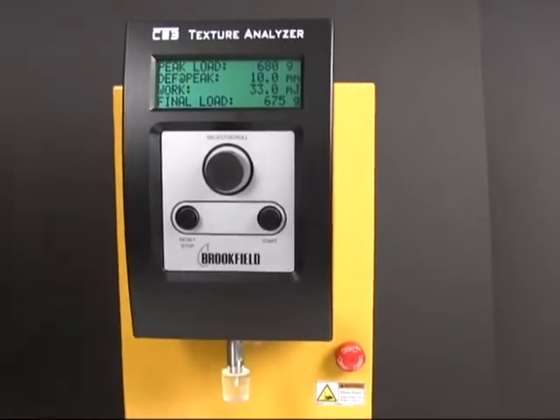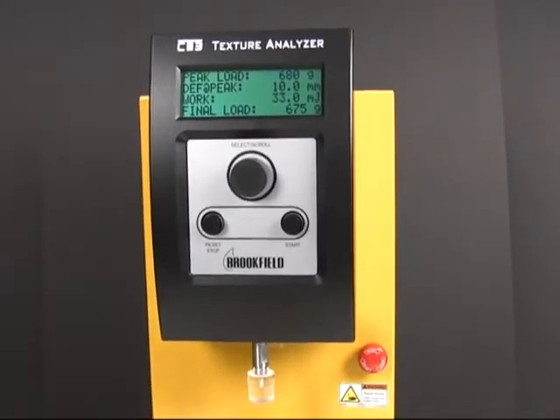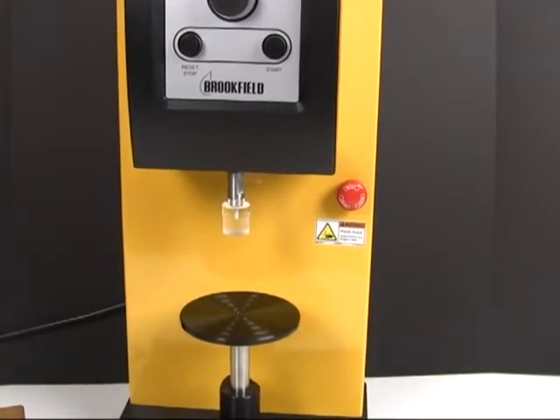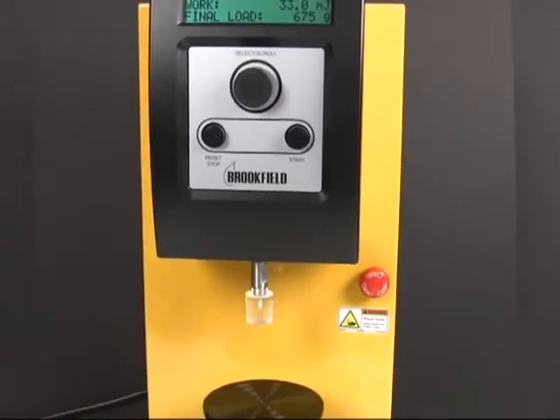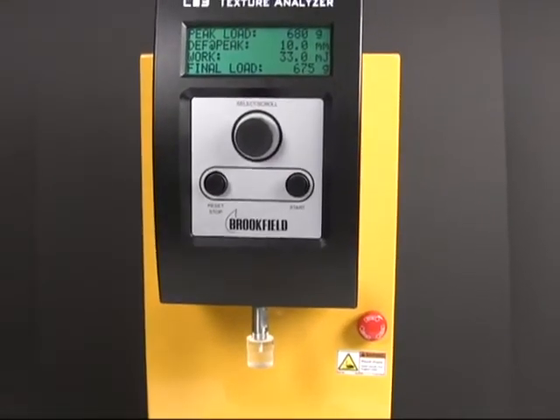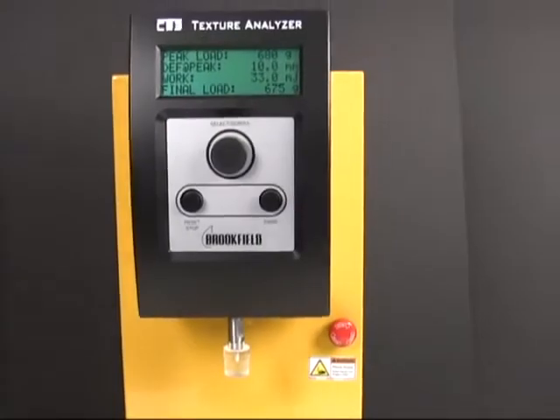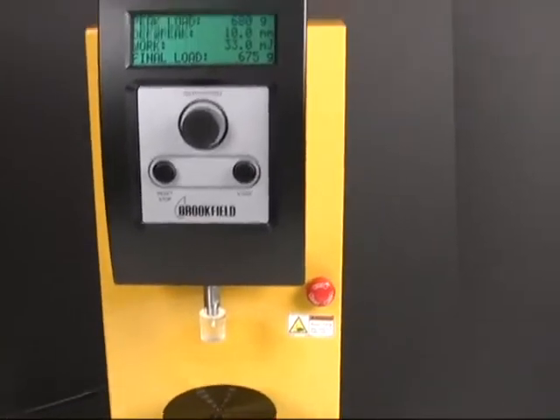I'm not a fan of the menu — it just drives me insane. It's not the fastest, not the most efficient. The actual run settings are pretty easy to mess up, so you gotta be careful. I highly recommend both writing down what your test settings were, as well as your pre and post test speeds from the other page, and then recording your final data. Because once you run a test again, it just forgets the previous data. Before you plug in the software, which I'll go into in a later video, there's no way to save the different test results besides pencil and paper, I guess. That's great for a multi-thousand dollar instrument.